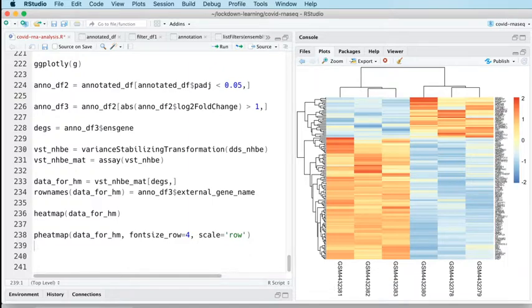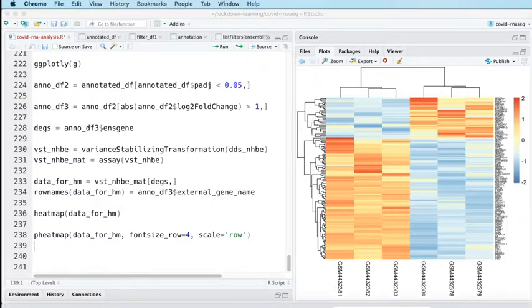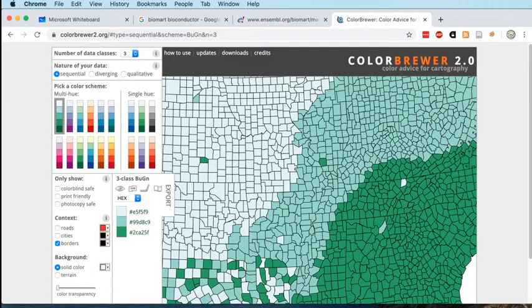One of the simplest ways of getting access to nice color schemes is a tool called Color Brewer. There's a website for Color Brewer actually, colorbrewer2.org, which looks like this, and which shows you the idea of the color schemes. These color schemes were originally designed for segments on maps, which is what the examples are showing you on the website.